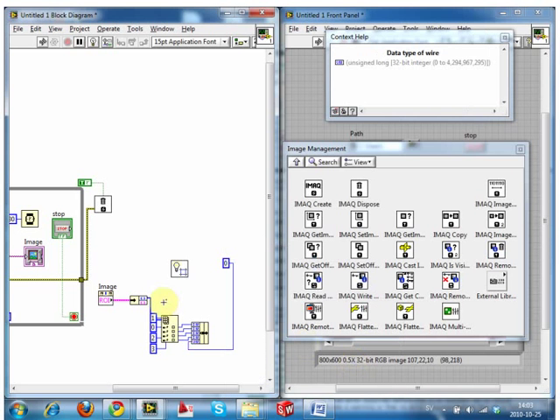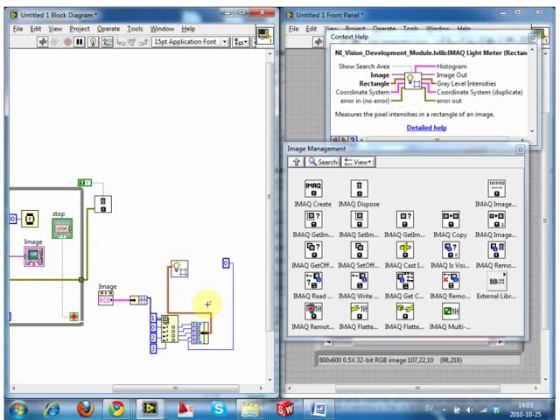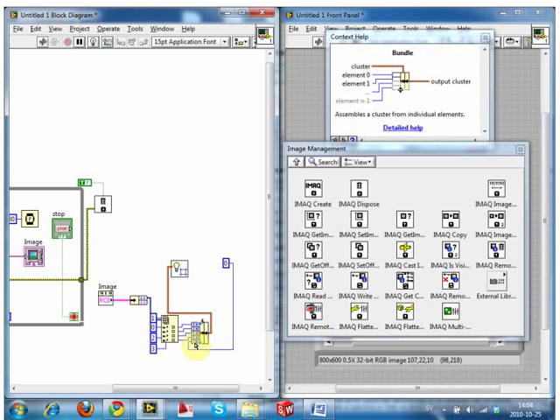No, it's not bringing up the error. But if it's saying something's wrong as it's running, it might run it. But to do it properly, we shouldn't use it this way. In this example, it might run it. It's saying it probably will run it.